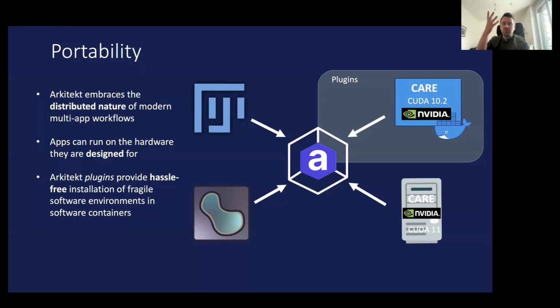So the same is true if you have Napari, for example, and you want to run a Fiji plugin, you call that Fiji plugin, and you also send it back. It doesn't need to be anything more. You can use Arkitekt, the workflow interface, to start a workflow, and this is then a mini workflow, which just says, use the currently run image, send it to Fiji and come back, and you can start this from any application. And then you have that, for example.